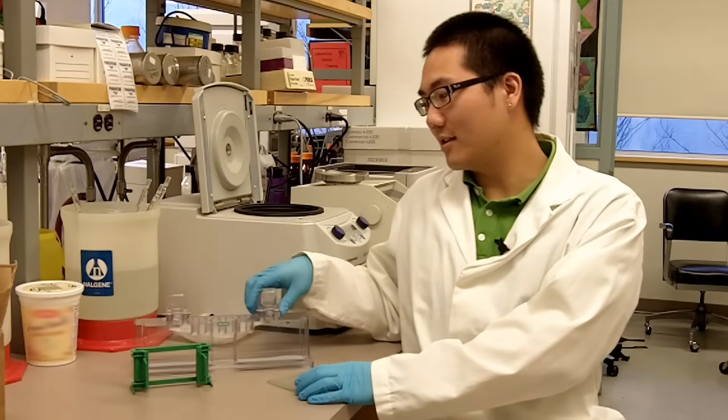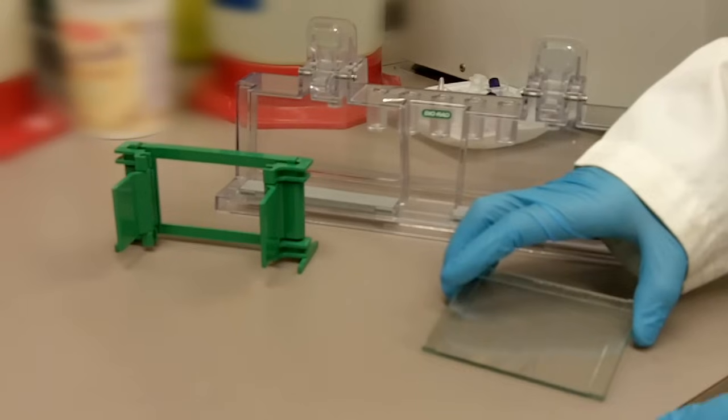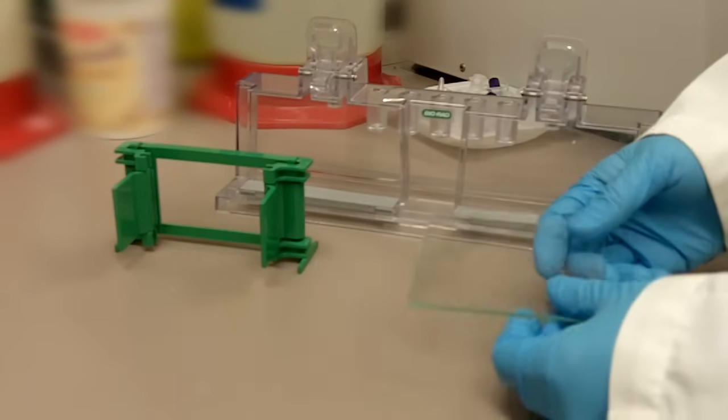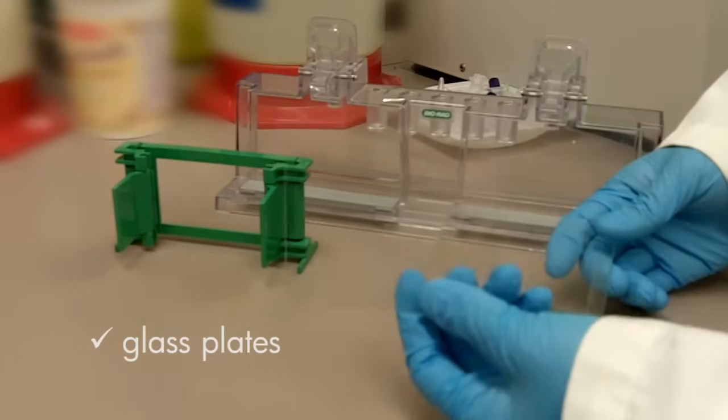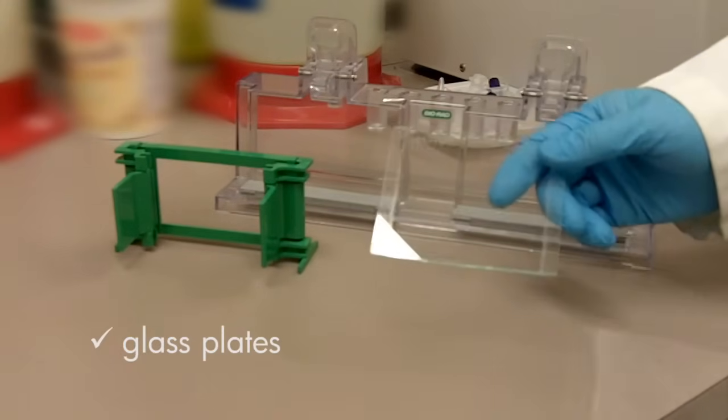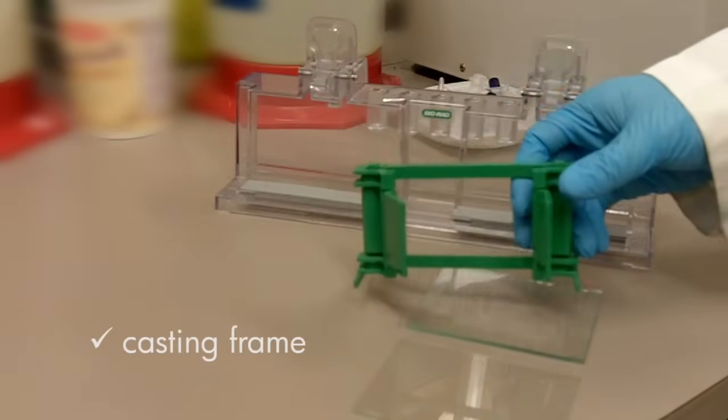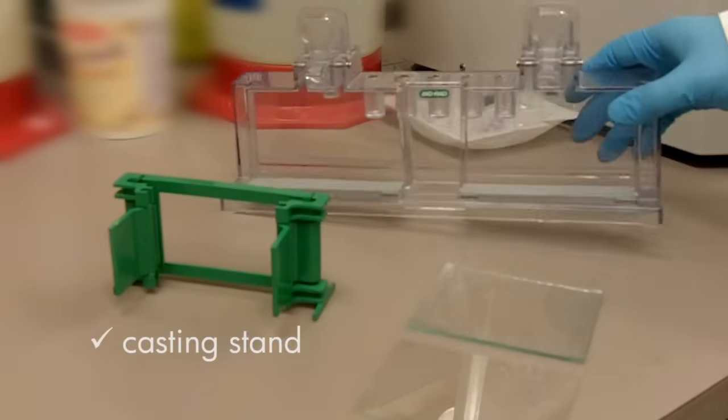Here is the apparatus for casting the gel. There are four different parts to this gel apparatus. First of all, you have two glass plates: a short plate and a tall plate. Then you also have a casting frame and a casting stand.